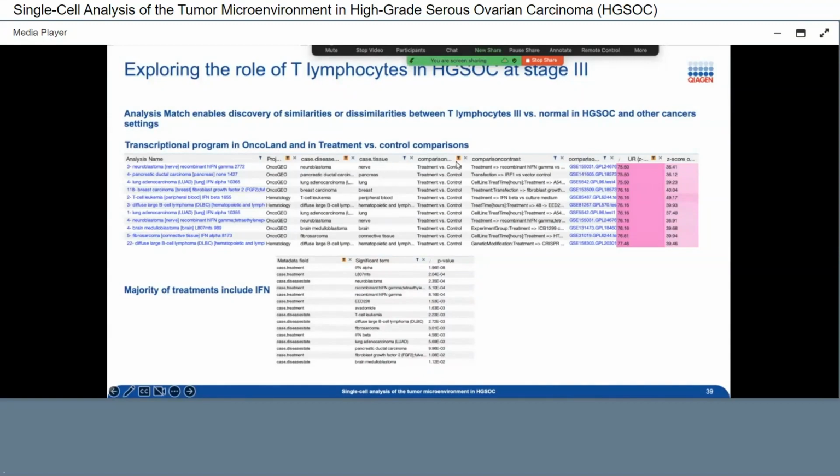I have a reason behind it, because I would like to know in what conditions that stage 3 versus normal for T lymphocytes brings anything of value for me. Is there any particular treatment that it represents, or is against or dissimilar of treatment that could be useful further after, right? So I selected that.